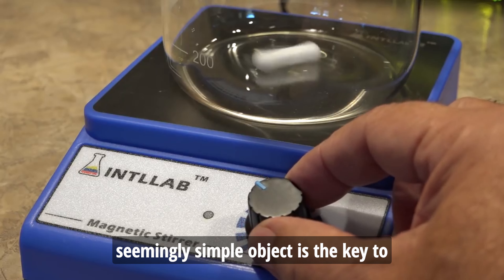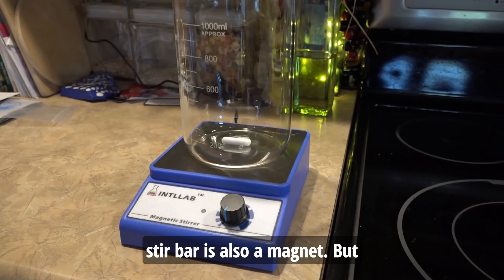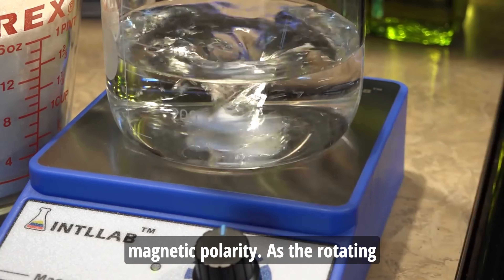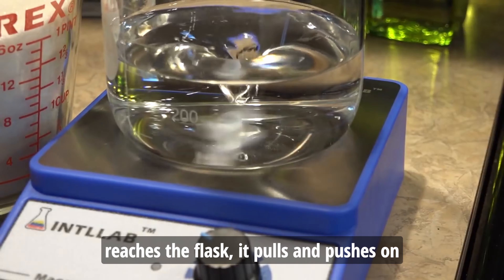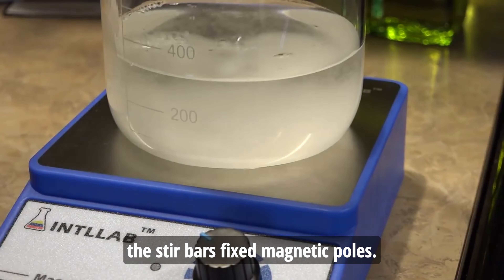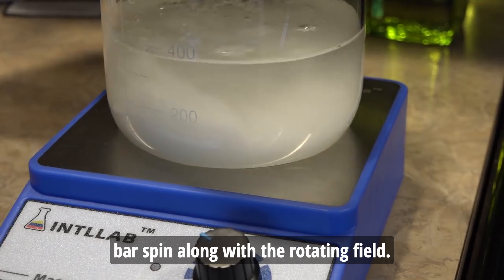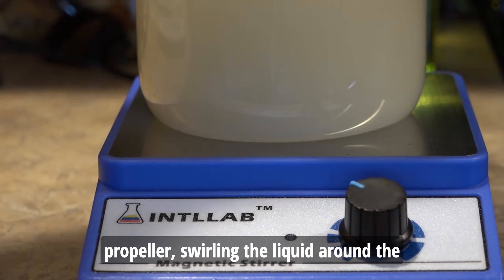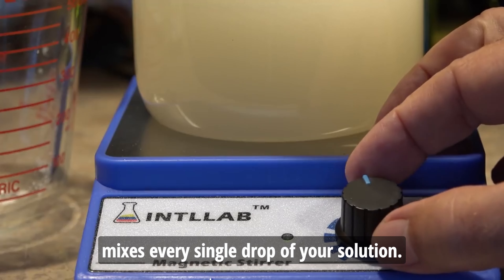This seemingly simple object is the key to mixing the solution. The stir bar is also a magnet, but unlike the electromagnet, it has a fixed magnetic polarity. As the rotating magnetic field from the electromagnet reaches the flask, it pulls and pushes on the stir bar's fixed magnetic poles. This creates a force that makes the stir bar spin along with the rotating field, acting like a tiny propeller — swirling the liquid around the flask and creating a smooth vortex that mixes every single drop of your solution.